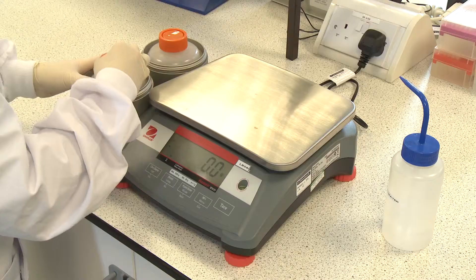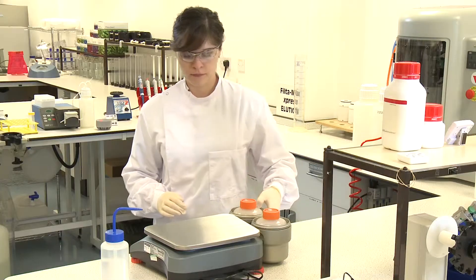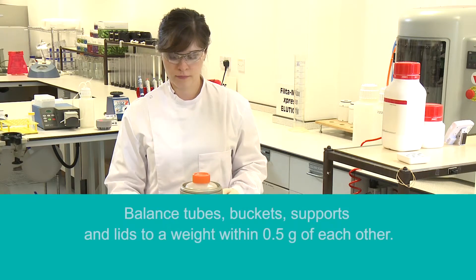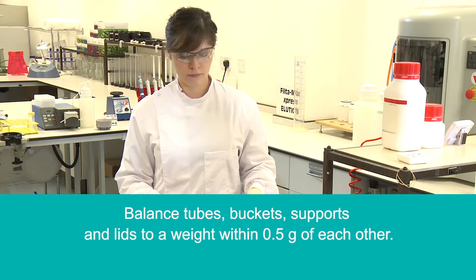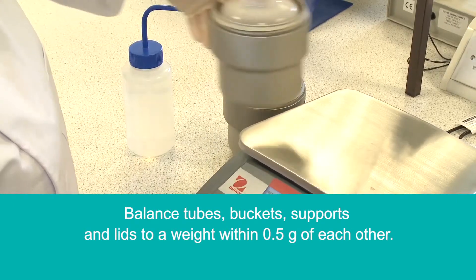Take the 500 milliliter vessel now containing the filter eluate and balance it ready for centrifugation. Tubes, buckets, supports and lids should be balanced with reagent water to a weight within 0.5 grams of each other.